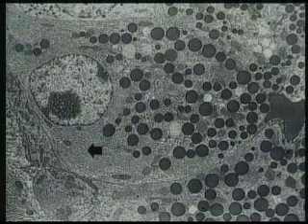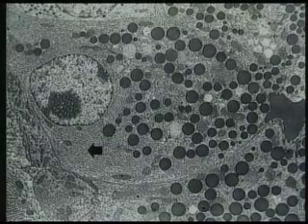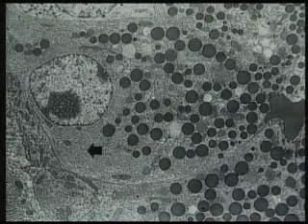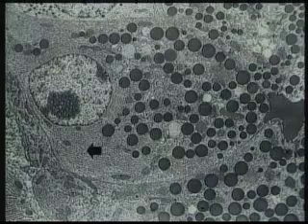What is the arrow sitting in and pointing to right here? You can see a whole series of sort of thin lines that are parallel. What system are these lines all part of? If you said the rough endoplasmic reticulum, or rough ER, you're absolutely right. This is an electron micrograph of a pancreatic acinar cell, and here in the basal pole of the cell we have a very well-developed system of cisternae of the rough endoplasmic reticulum.